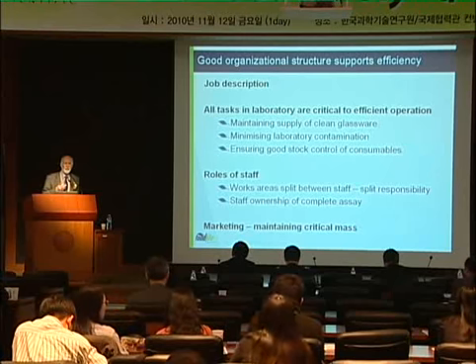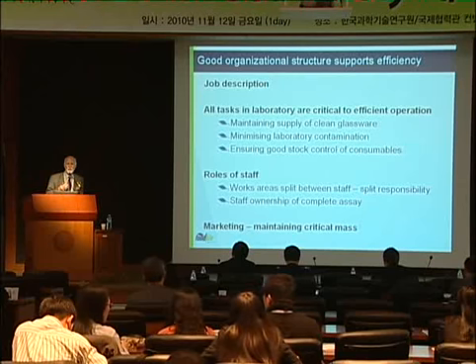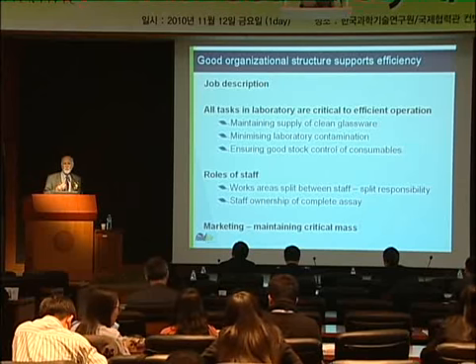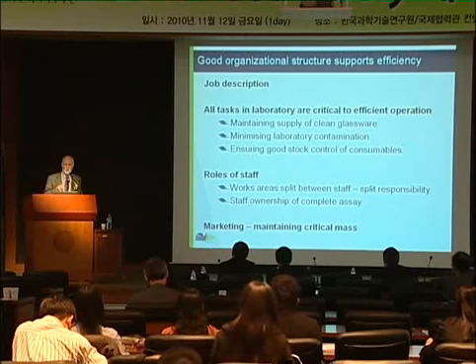We tend to forget how sensitive the instruments are that we're using. We're working at parts per trillion levels. Very, very small amounts of contamination in the laboratory can cause large problems.